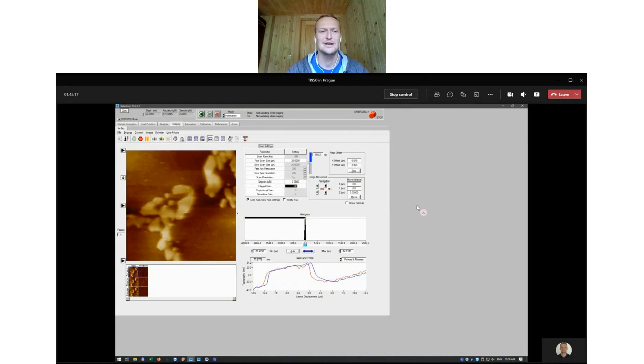The sample that I picked for today is a cross section of a weld. So we see different structures in there. We see precipitates, we see hard and soft phases. The soft phase is basically the steel matrix, and then we have some precipitates and a hard phase, or carbides, in this soft matrix here.